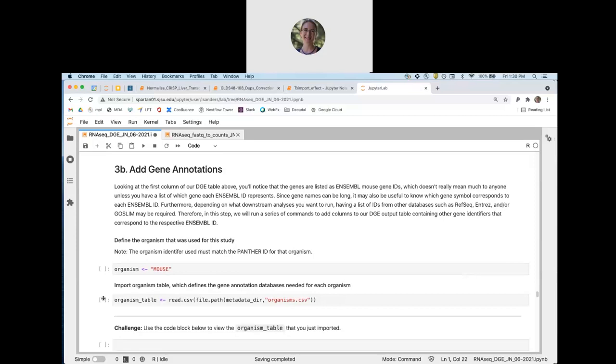And so we can access certain databases which have lists of genes which are known to act in certain pathways. These are also known as functional annotations because instead of looking at 100 genes, you can look at one pathway name and say, oh, this set of genes is involved in mitosis or something like that. So that's all going to be very useful.